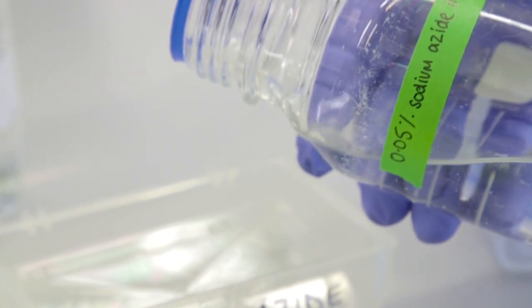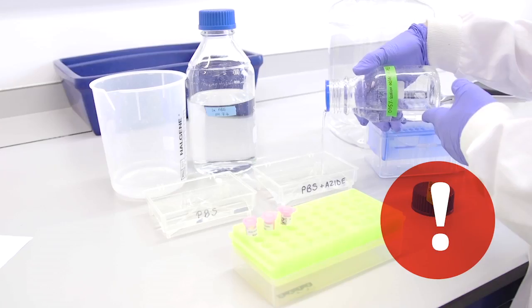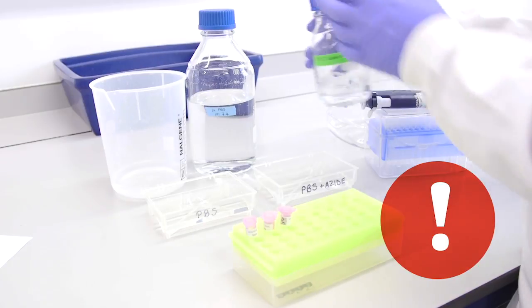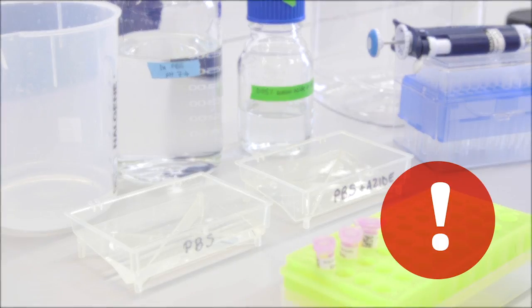Sodium azide is used as a preservative but can be hazardous and very toxic. For this procedure, it is used only at a 0.05% dilution in PBS at pH 7.4 in small volumes. When preparing this from a 10% stock bottle, it is advisable to use a fume cupboard.